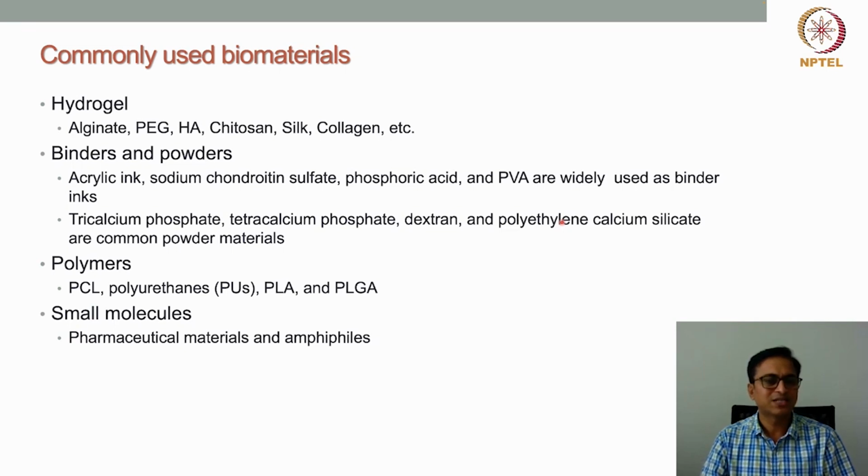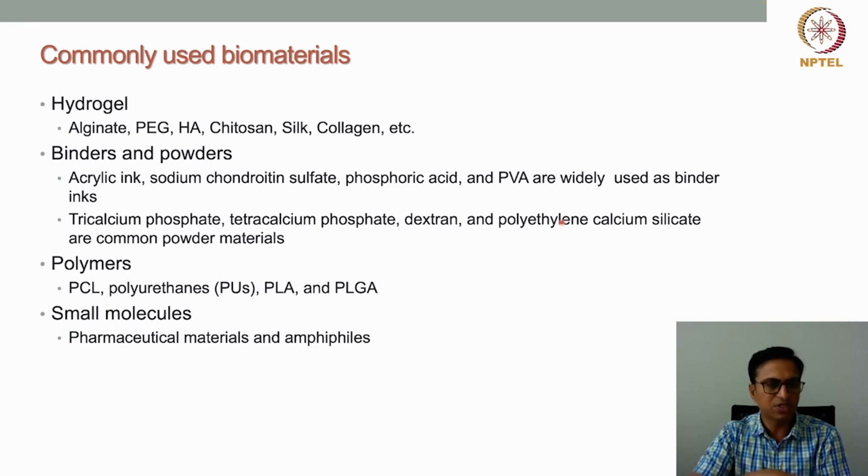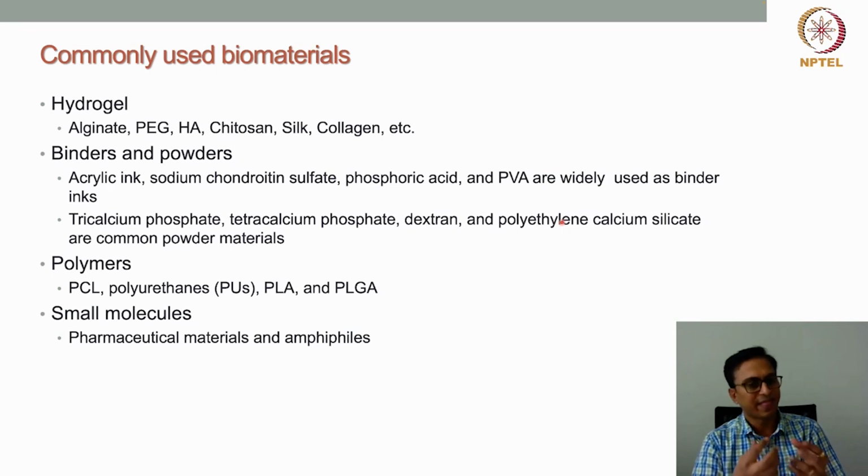So here the concept is, using a powder bed, we put the binders using this inkjet principle, where the droplets are generated from the binders, and then they are delivered onto the powder bed, and the binders bind the powders at certain locations. And then we generally solidify the whole thing.